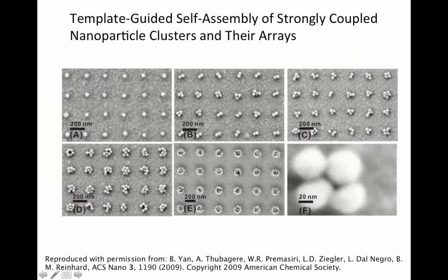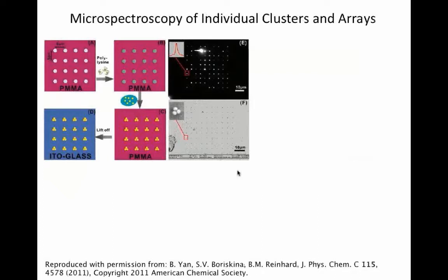If you have access to these clusters at defined locations, this opens up the possibility now to create an array of these clusters with sufficient separation between individual clusters that we can read out the spectrum through a micro-spectrometer. And in a second step, after the spectral characterization, we can in principle then again take this sample, transfer it into the scanning electron microscope to obtain structural information.